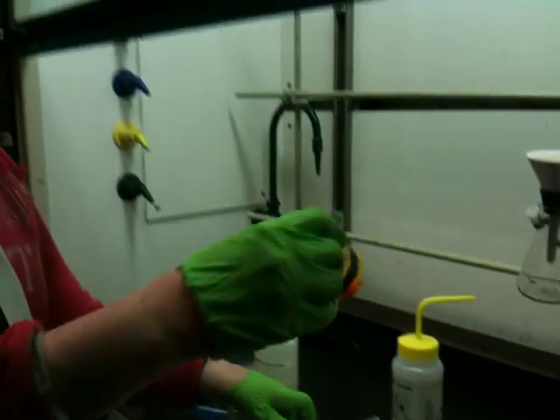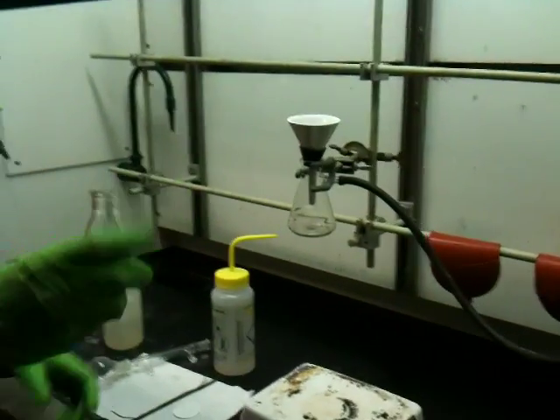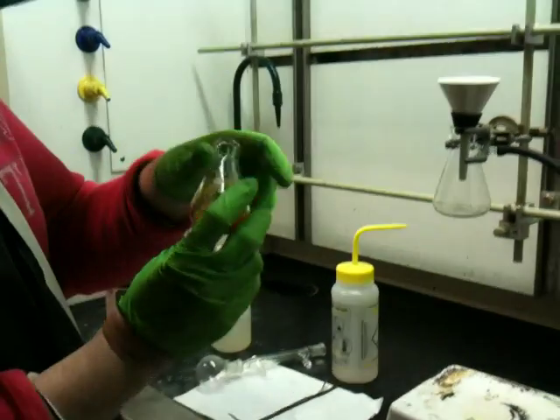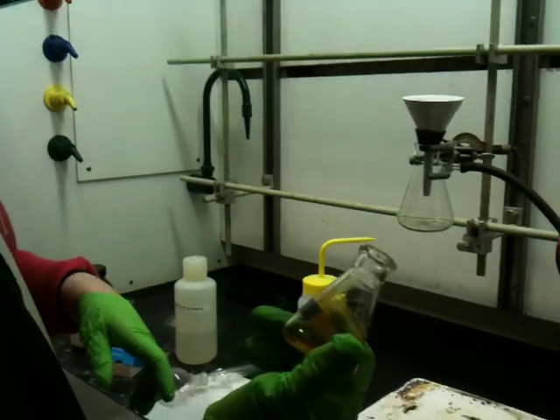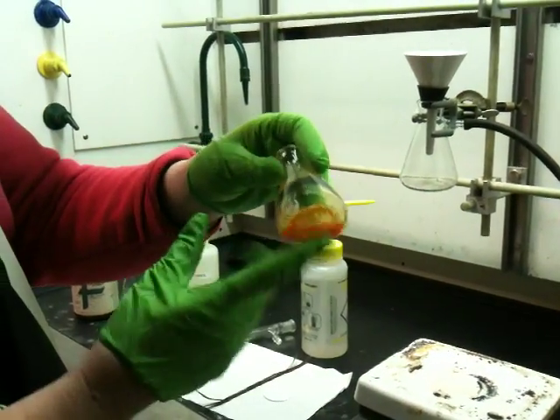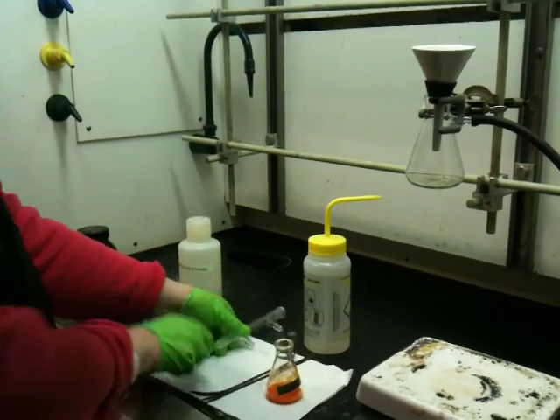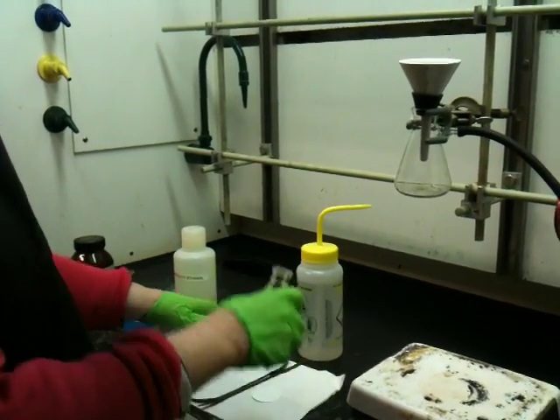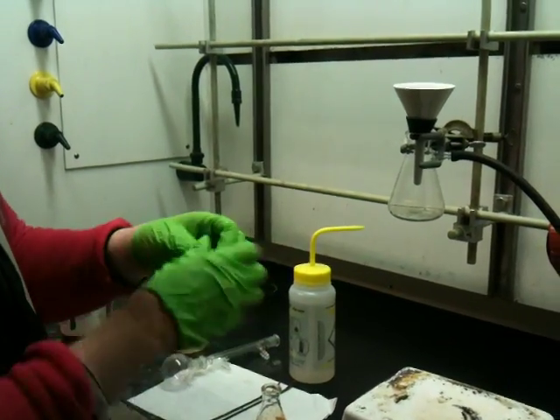I have my sample in an Erlenmeyer, and what I want to show you is a technique I call making an omelet — it's a method I use to get all the compound transferred. Your sample will be in a round bottom, not an Erlenmeyer. I'm going to take this and vacuum filter it.